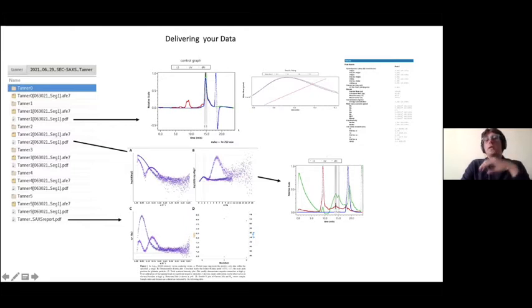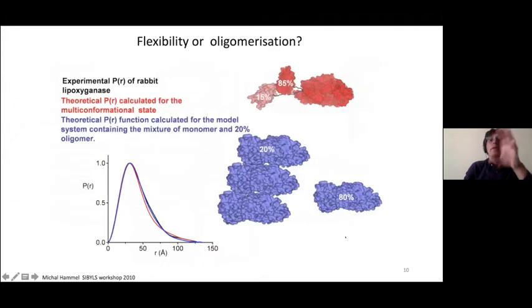So that's why you check the MALS and check those PDF reports before you ask the question, oh, where is my SAXS data for this sample? This is exactly shown here. There is no signal that we can detect. Why it could be: we also have cleaning columns before the main column, and that may separate all the aggregation, and no signal can be detected from the rest of the sample.